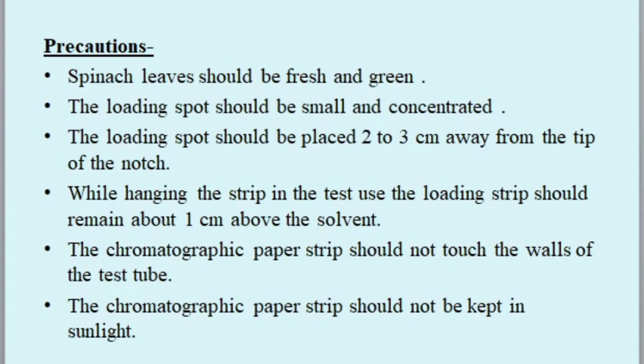Precautions: spinach leaves should be fresh and green. The loading spot should be small and concentrated, placed two to three centimeters away from the tip of the notch. While hanging the strip, the loading spot should remain about one centimeter above the solvent. The chromatographic paper strip should not touch the walls of the test tube and should not be kept in sunlight.